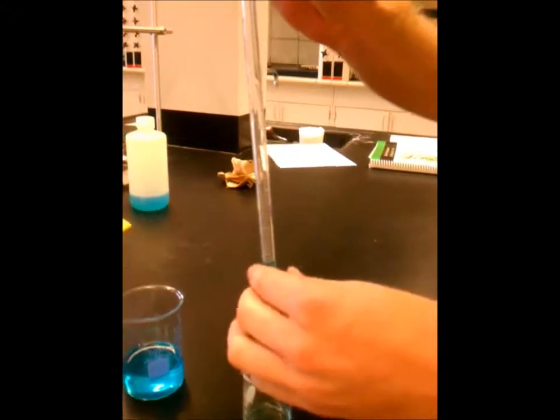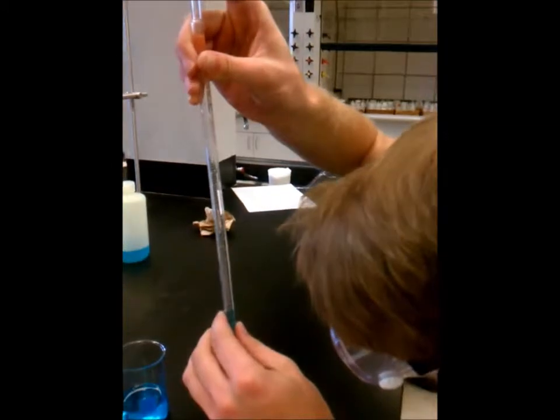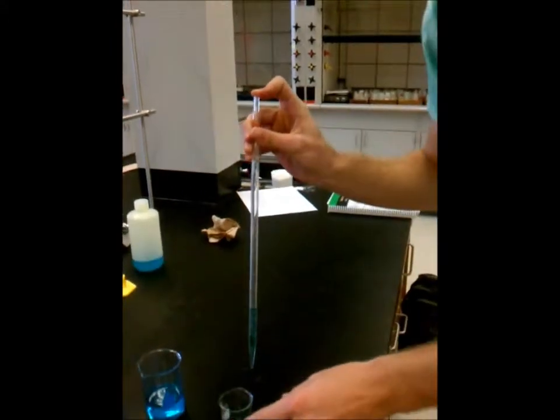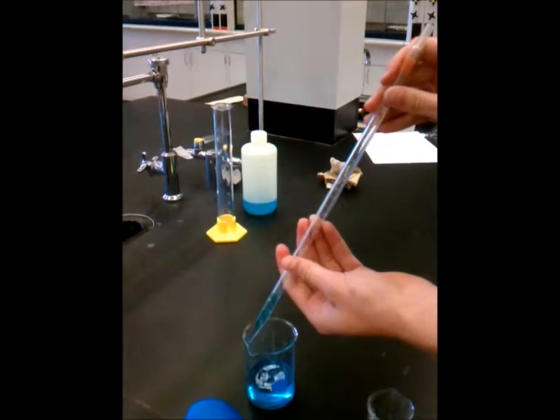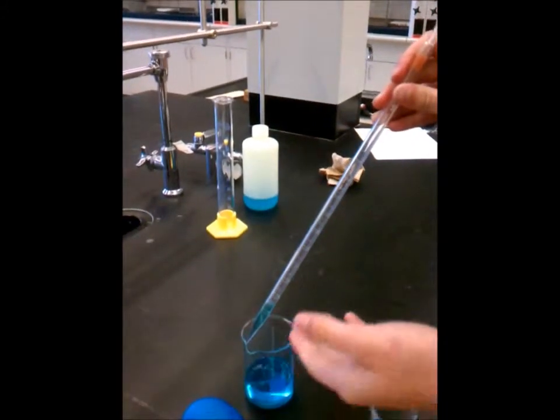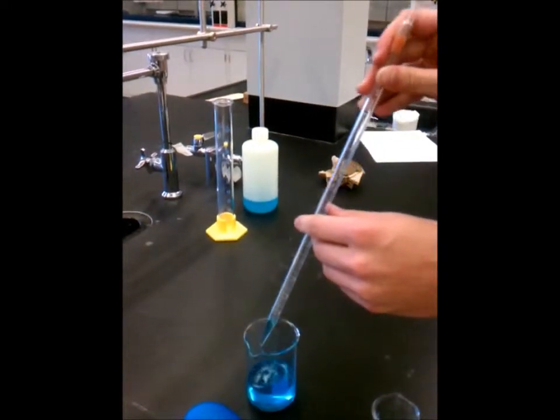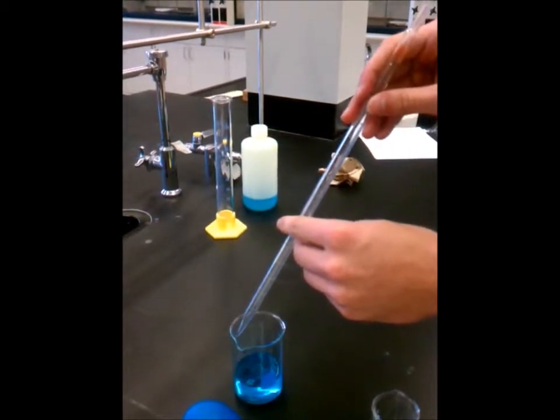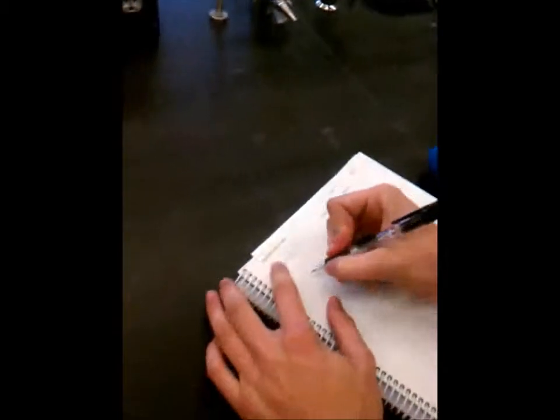I'm going to stop it. And now I'm at 8.21. And now, I'm going to let it out right here. We usually don't let our waste go into the same beaker, but this is a special case. So I'll set that down and write my measurements over here.